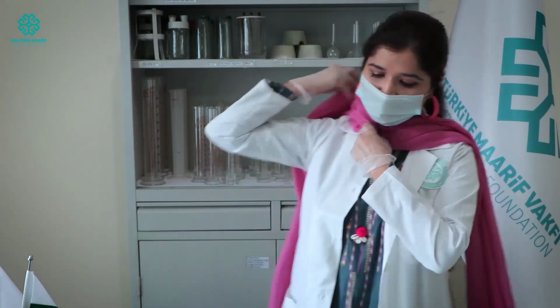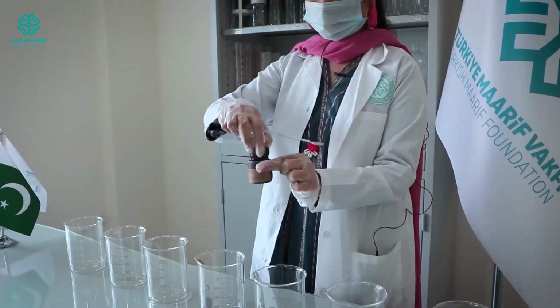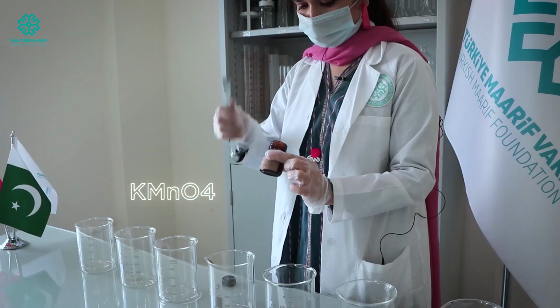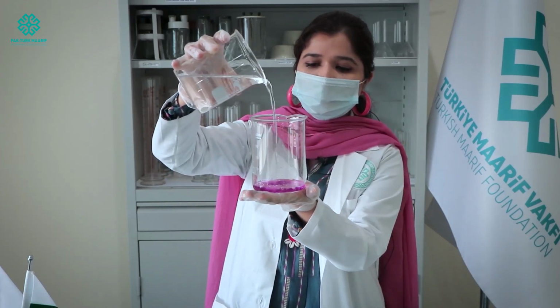Okay, now I am going to transfer the solution of beaker 3 to beaker 4. What is in beaker 4 is a few crystals of KMnO4, potassium permanganate. Now transferring the solution of beaker 3 to beaker 4, and you will notice the color appears again.